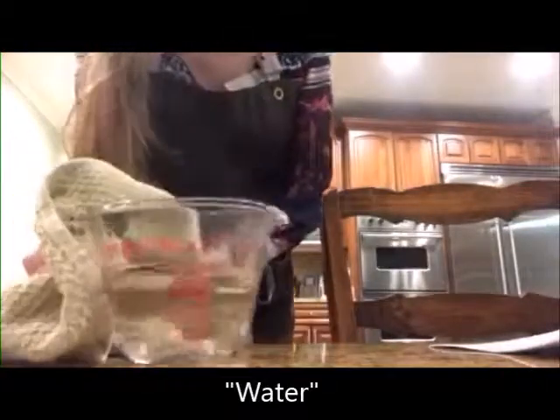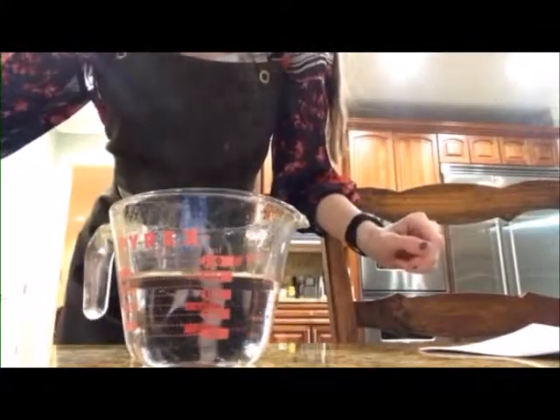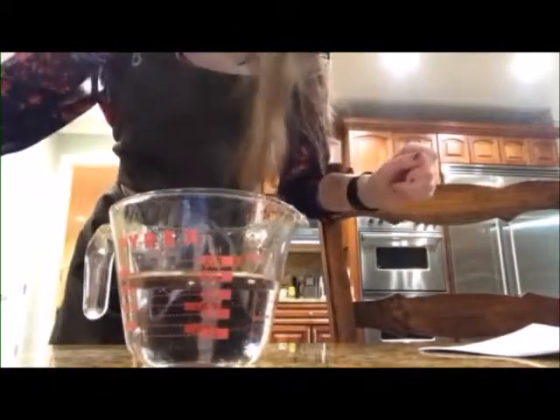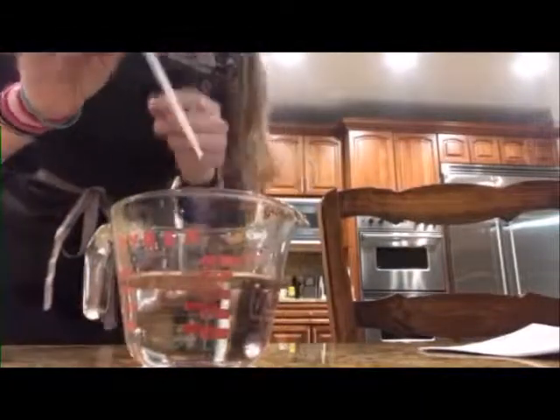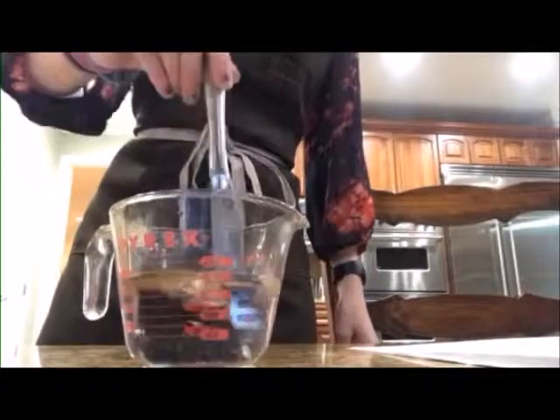Once the water's reached a boil, you want to take it out. You will notice that it boils because it will bubble. You will then want to pipette 2 milliliters of sodium citrate. You can then stir the solution.